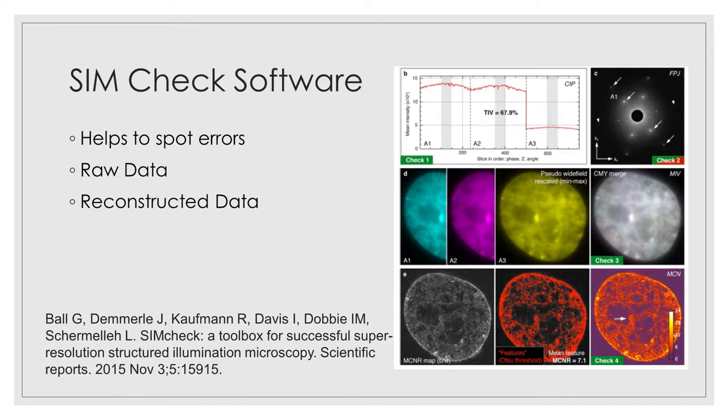SIMCheck is a free plugin for ImageJ, which can help to spot reasons for errors in the image, to see if something is actually an artefact, and to check that you're using the correct parameters. So it can tell you if there's errors in the calibration, or in the way that you did the imaging, or in the sample preparation or reconstruction.